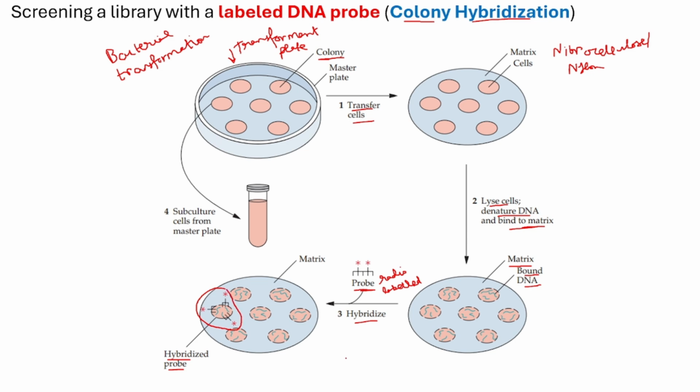Here they have shown 7 colonies. It might not happen that within all the 7 colonies there will be hybridization. Maybe out of 7, there are 5 colonies where you have found hybridization. Or it may happen that within the 7 colonies there is hybridization, but not to the same extent, because it depends on the sequence of the target DNA. If the probe has the complementary sequence of the target DNA, then only the probe will bind to the target sequence, otherwise it won't.